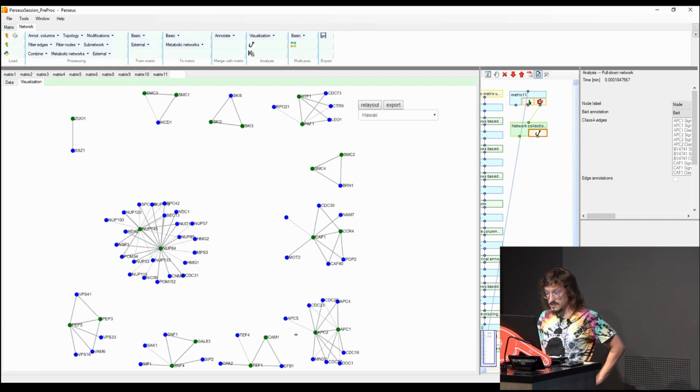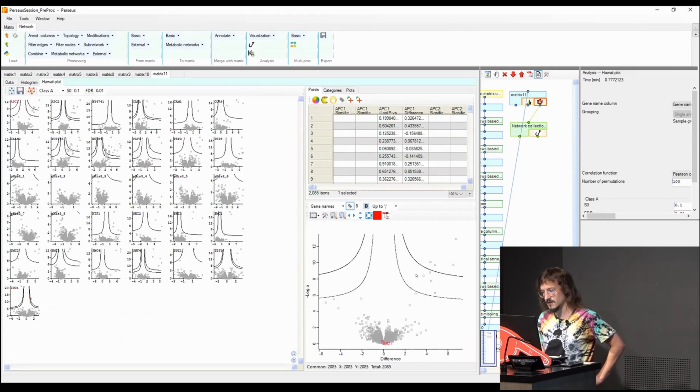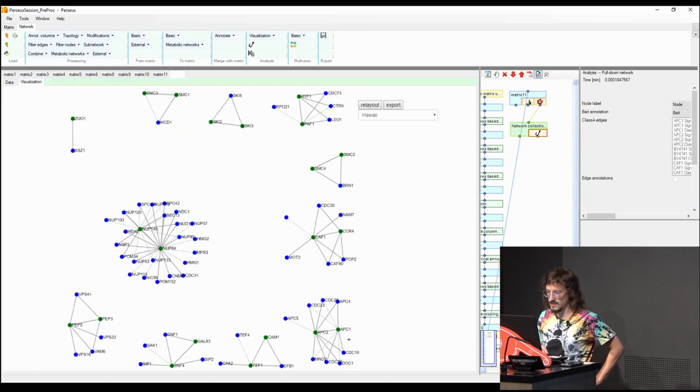And as you can see here in APC1 and APC2, we selected, as I said before, also those that were a bit less significant, still significant, but closer to this situation. You can recognize that because look how many we have, 4 and 4 for both of them.